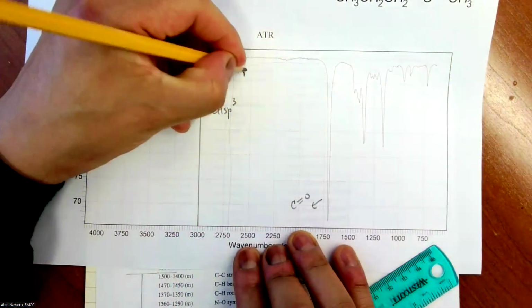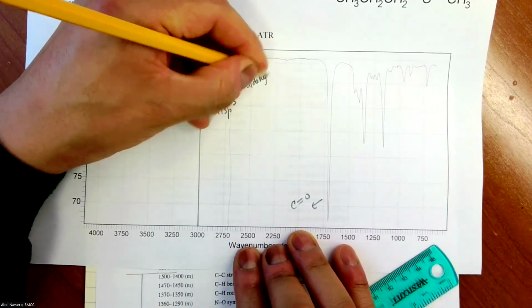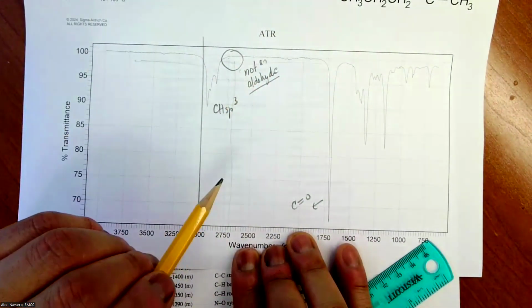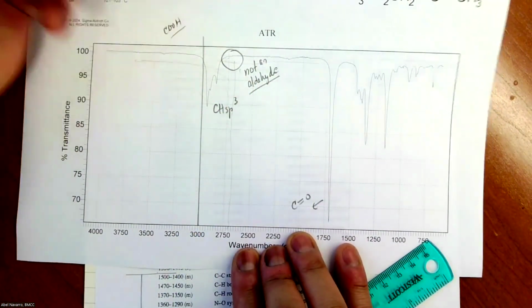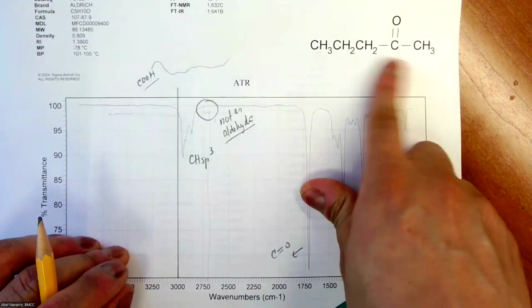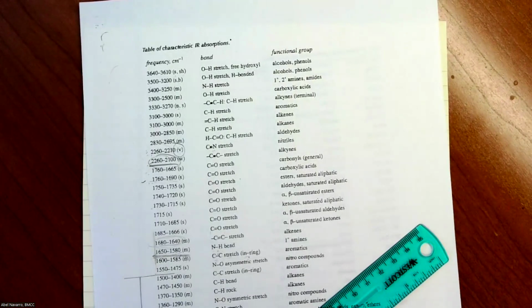You don't have to write this, but I'm writing it for you to know: not an aldehyde, because I don't see anything here. It's not a carboxylic acid because I don't see the distortion. So this one is a ketone, and it makes sense. Look at the structure, it's a ketone.